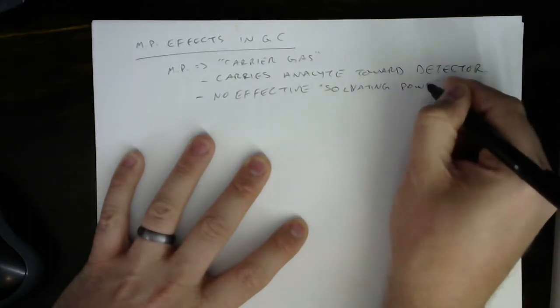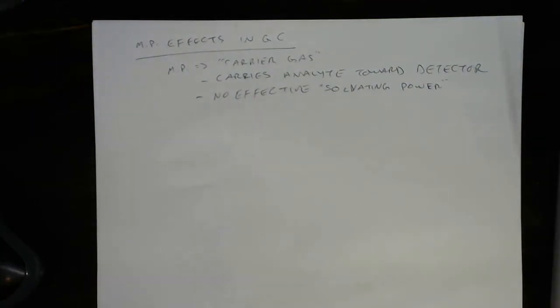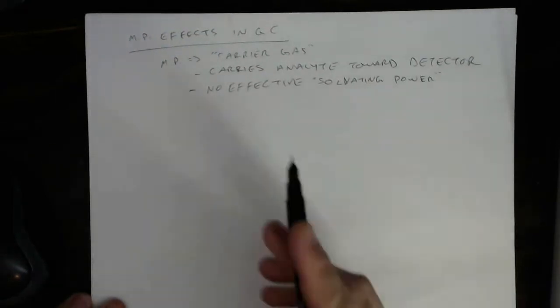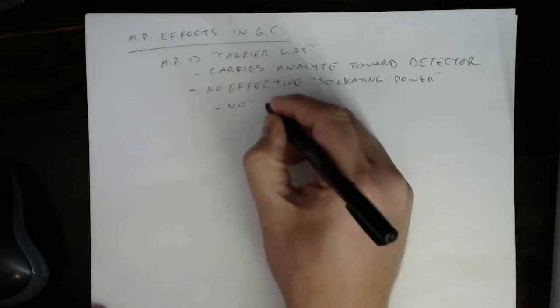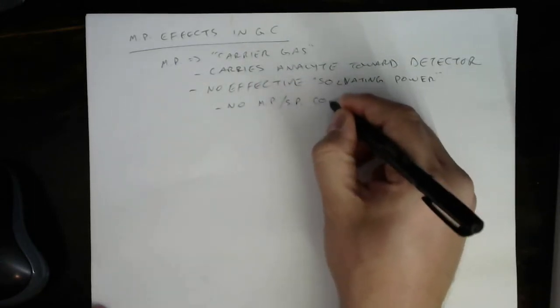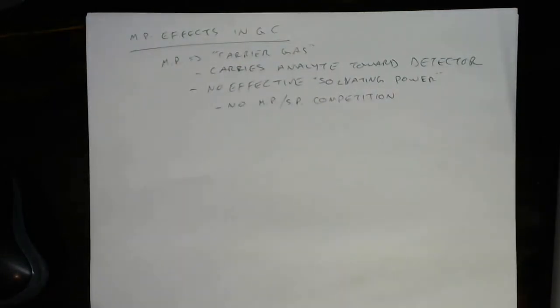It is not dissolving the analyte the way that solutions dissolve molecules into them. There is no competition. There's no mobile phase, stationary phase competition as there is in liquid chromatography.